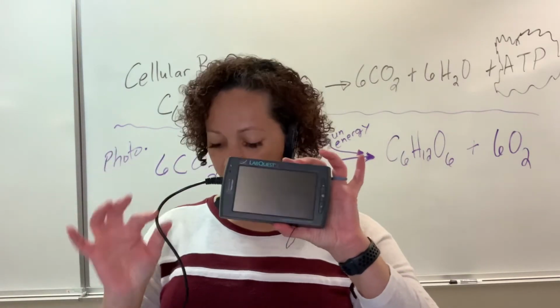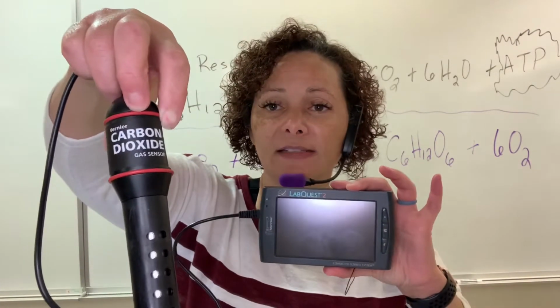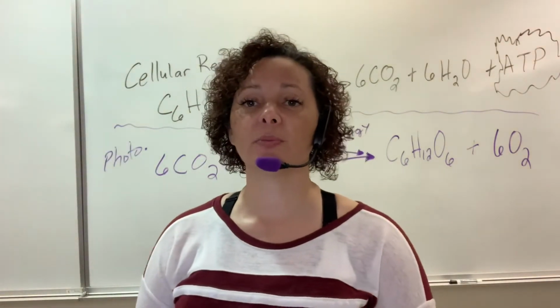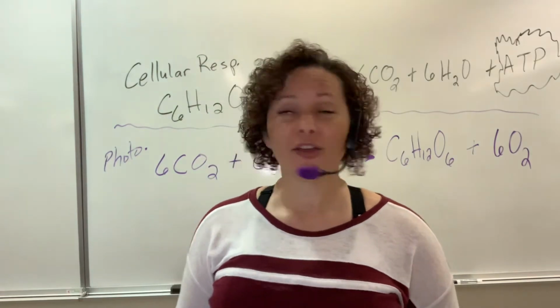You've plugged it into several different things. This time, you're going to plug it in to this, what it is called a carbon dioxide monitor. And so the carbon dioxide monitor is going to be able to detect how much carbon dioxide is coming out of an organism. Okay? So look at that.